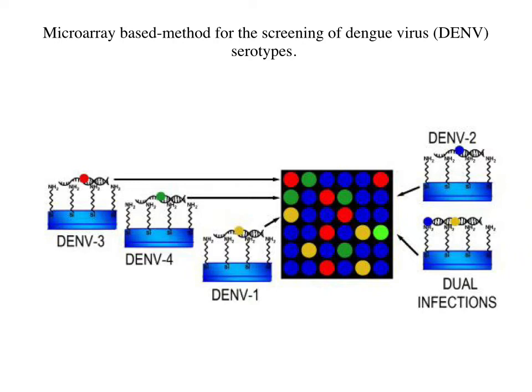The dengue virus isolates and dengue samples were used to evaluate microarray performance. The results demonstrate that the probes hybridized specifically to dengue virus serotypes, with no detection of unspecific signals. This finding provides evidence that specific probes can effectively identify single and double infections in dengue virus samples.